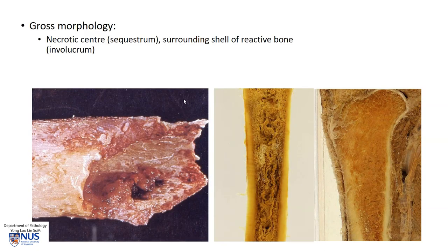Grossly there is often a necrotic center known as the sequestrum — as you can see here, this reddish area — and there is a surrounding shell of reactive bone which is viable or living bone. This gives rise to a very mottled appearance with some areas suggestive of cavitation, some friable brittle appearing dead bone, and surrounding viable bone.